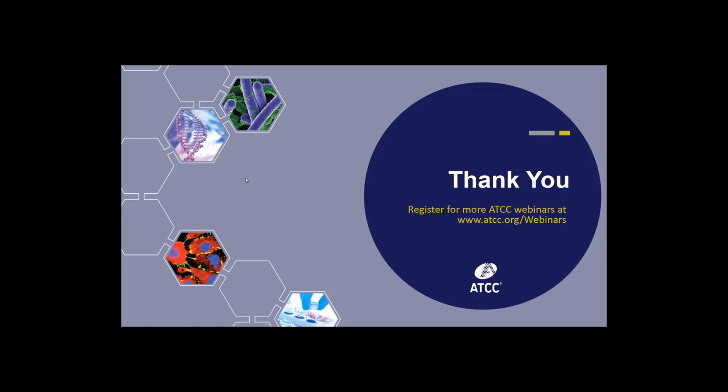So we're going to take one last question, and that is, is this type of analysis specific to Mycobacterium, or can it be applied more broadly to other species? Another great question. It's not specific to Mycobacterium, and it can absolutely be applied to other species. If you recall during the description of DDH and DDDH, I described how it can be used to tell whether two genomes belong to the same species or not. That can be any species at all. The sort of analysis that we reported in this paper is to compare a particular isolate against a species type strain to determine whether they belong to the same species, independent of what that species is.